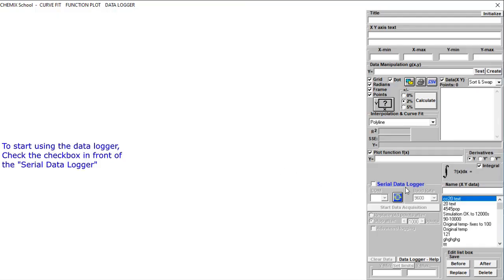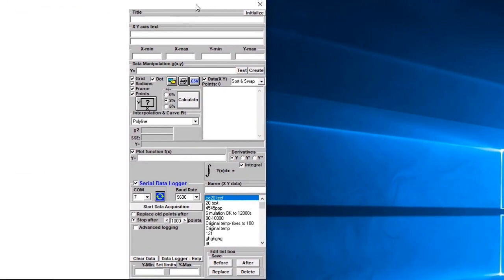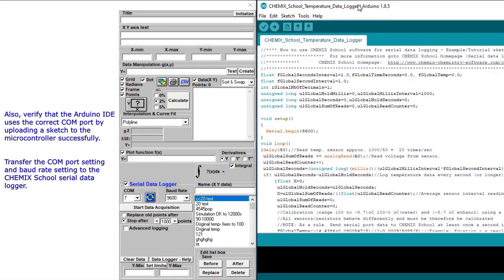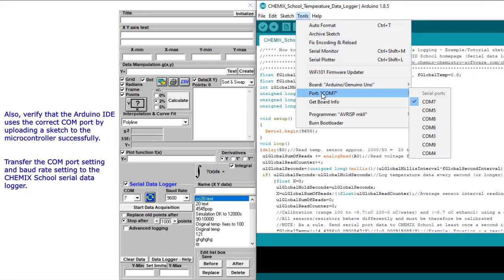Enable the logger by checking the Serial Data Logger option. Make sure that the COM port in the Chemex School Data Logger is the same as in the Arduino IDE. Also check the logger baud rate versus the baud rate given in the sketch.